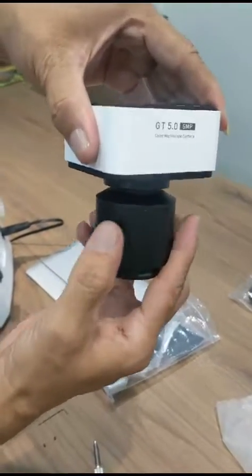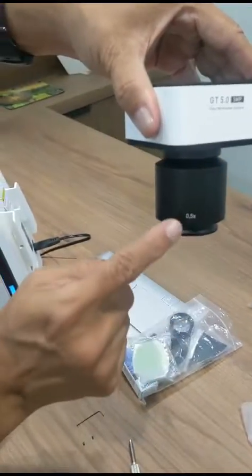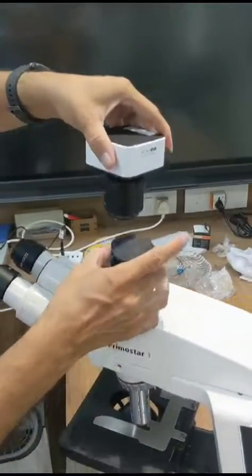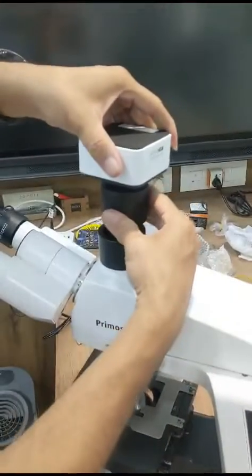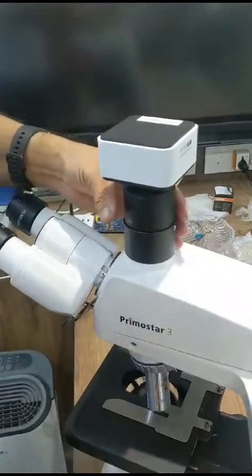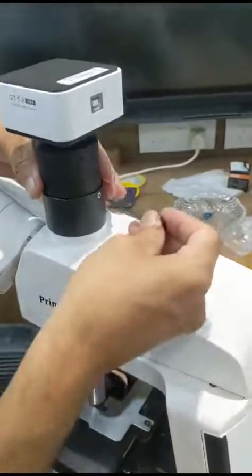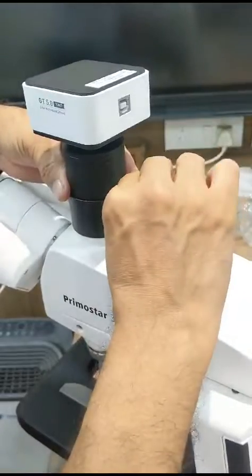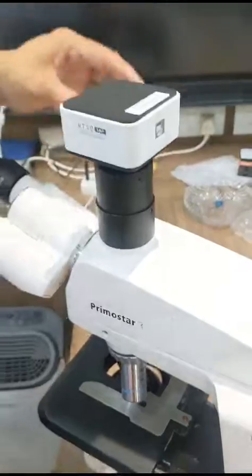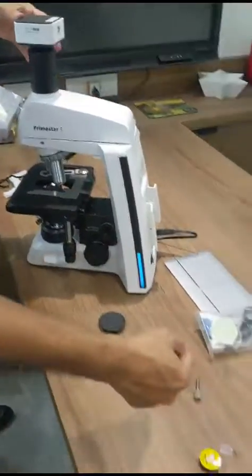Thread in the C-mount adapter — this is a 0.5x C-mount adapter. Take out this cap, put the adapter and the camera on the trinocular, and see that the cable comes out at the back side. Tighten the Allen screw. That completes installation of the camera. Now you have to put the USB cable and connect it to the computer.